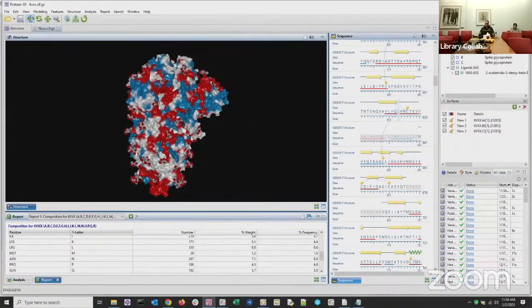And anyway, you guys, that's the power of the tools, is that we can quickly go from SNP to structure and then use our tools to model those structures and then have a new model with new rotamers that we can use for analysis. Thank you so much.